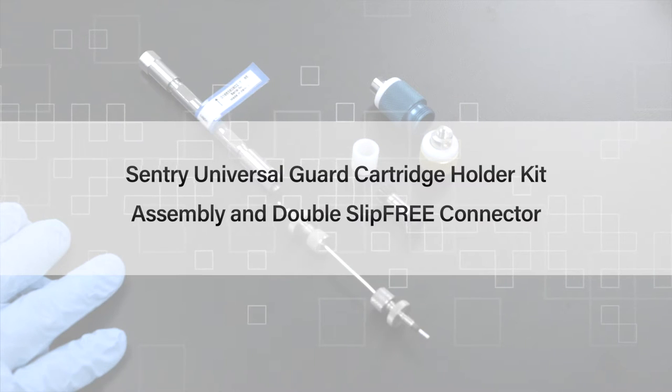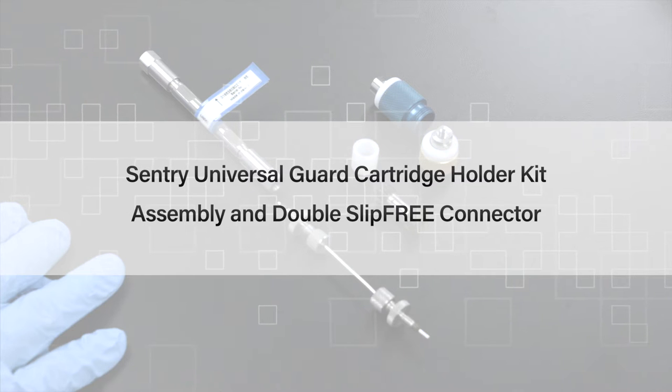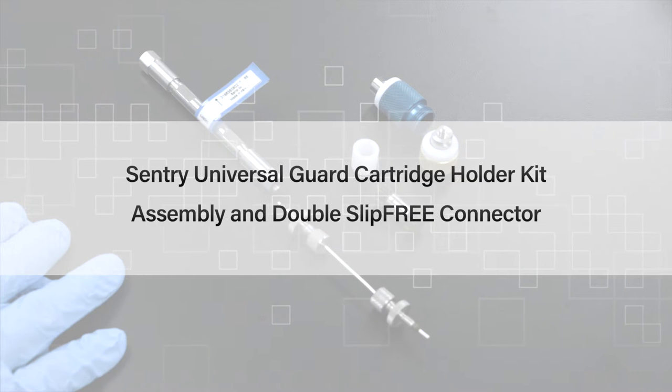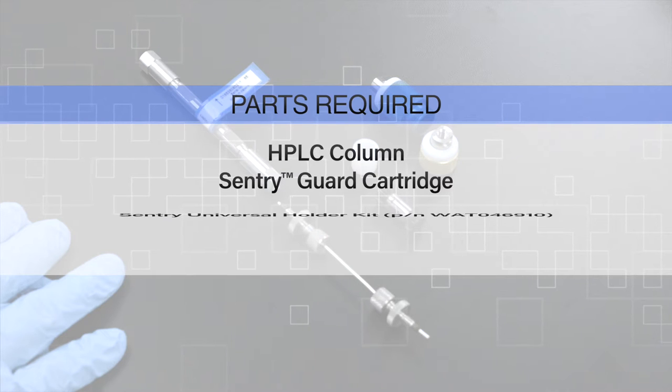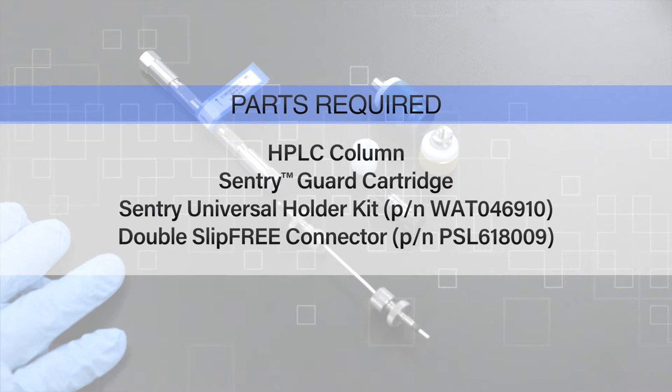This video will demonstrate the proper assembly of a Waters Sentry Universal Guard Cartridge Holder Kit using a double-slip free connector. Listed here are the products featured in this video.